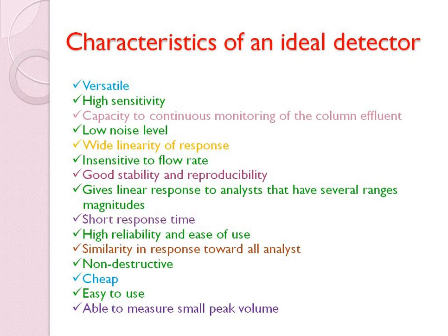Then it should give shorter response time, it should be highly reliable and easy to use. It should have similarity in response towards all analytes. It should be non-destructive, cheap, easy to use and able to measure small peak volume.